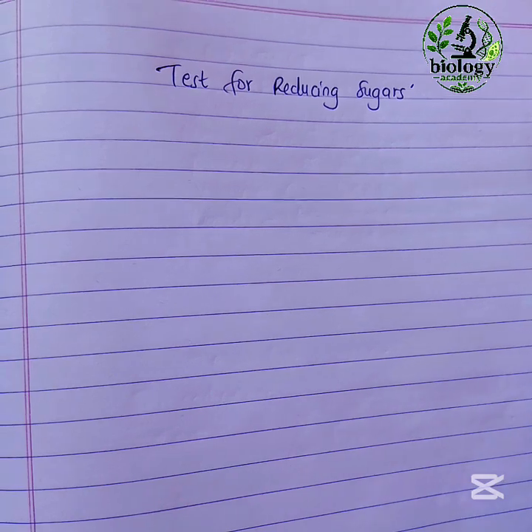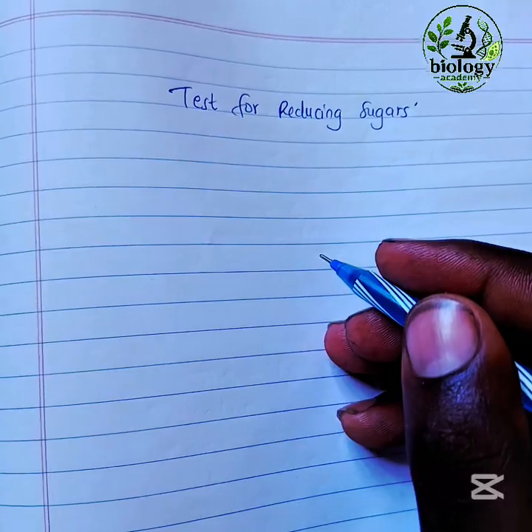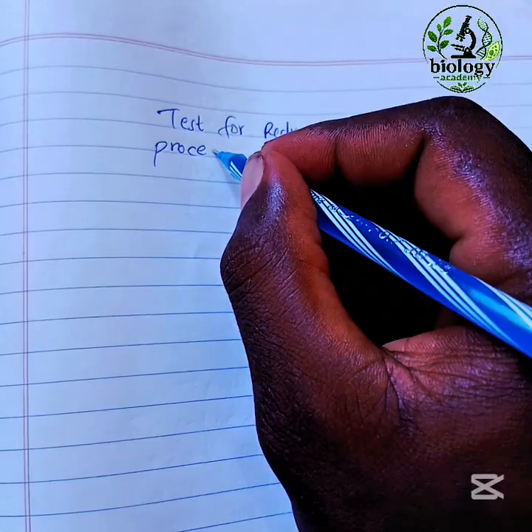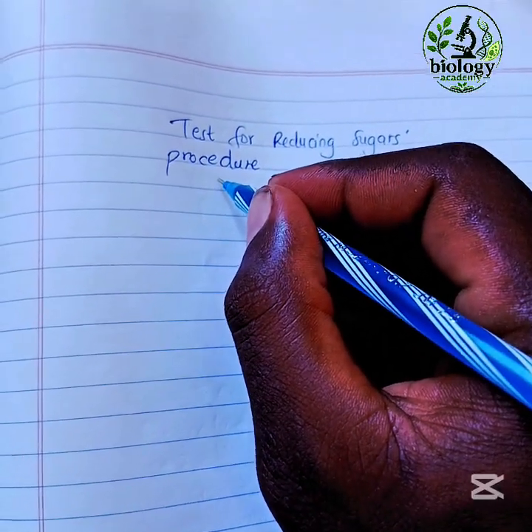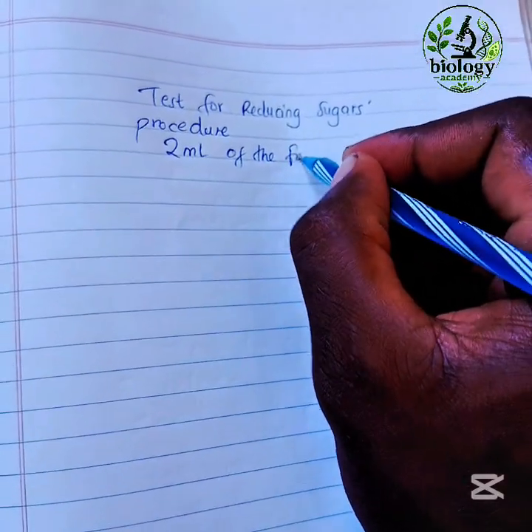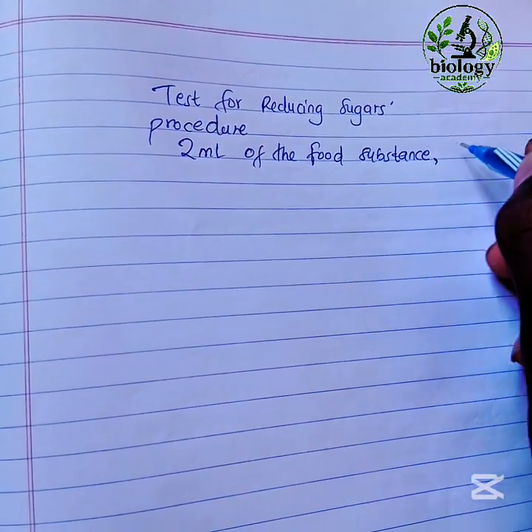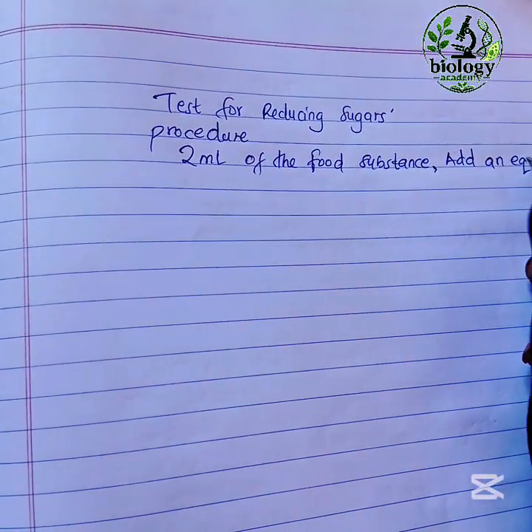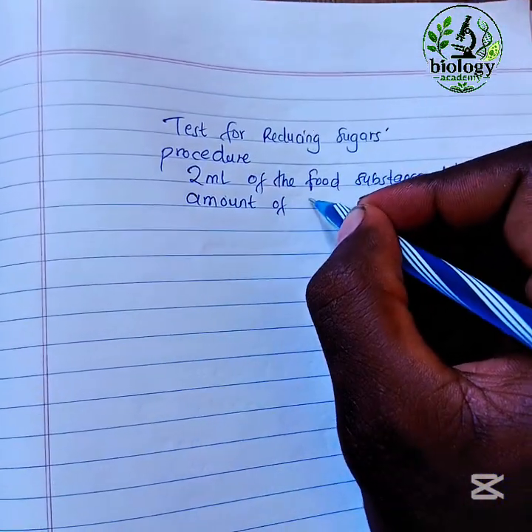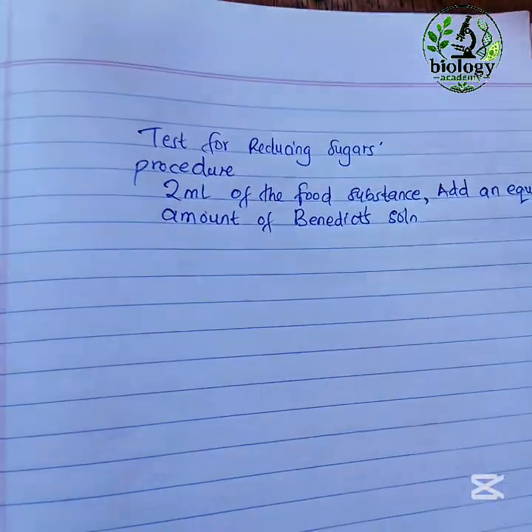Now, let's talk about the test for reducing sugars. In the test for reducing sugars, the main reagent is Benedict's solution, if you can remember. And this is the procedure for testing for reducing sugars. Number one, to 2 ml of the food substance, add an equal amount of Benedict's solution.